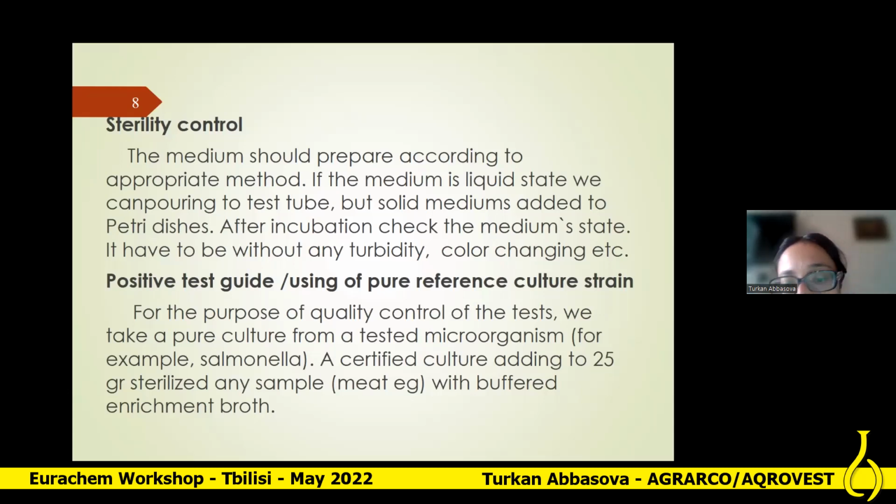And therefore, every laboratory should keep in its own laboratory certified reference culture strains in the microbiological laboratories, such as Salmonella, Staphylococcus, etc.